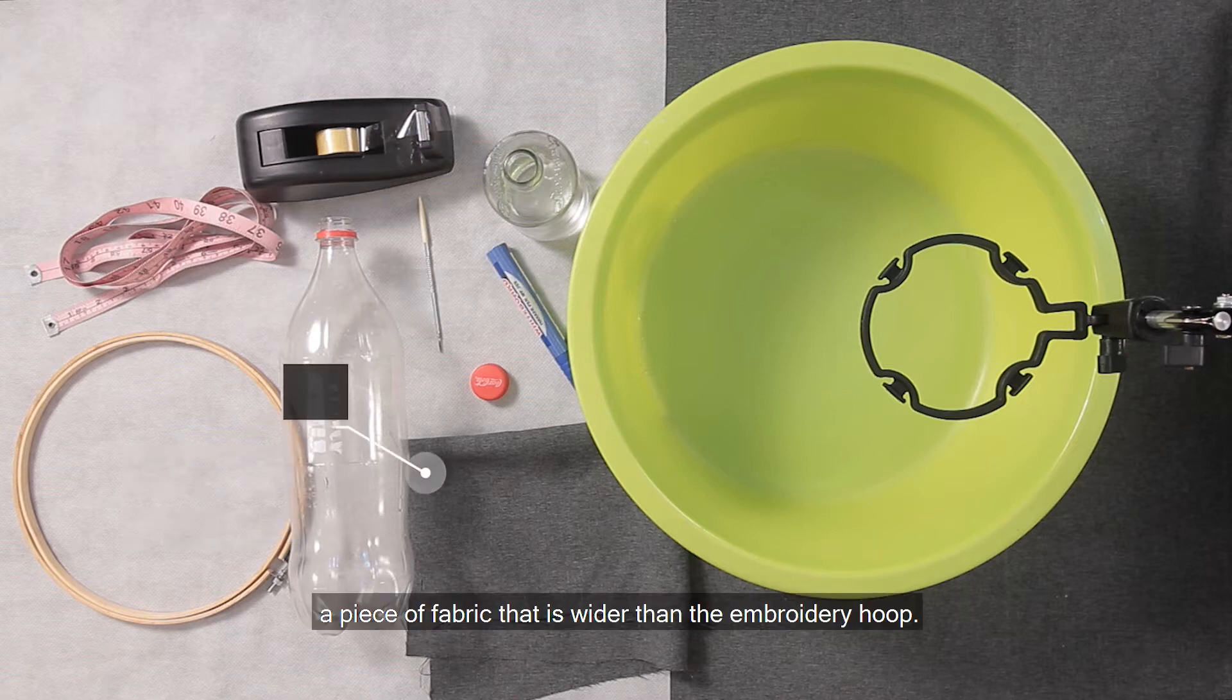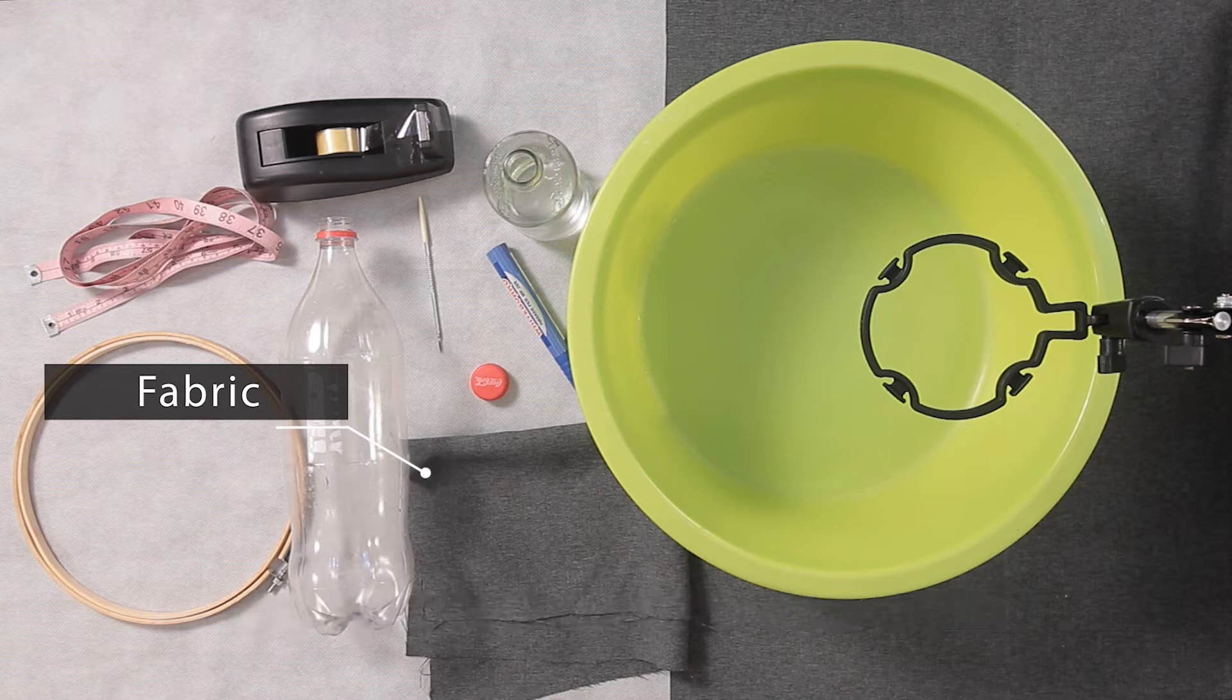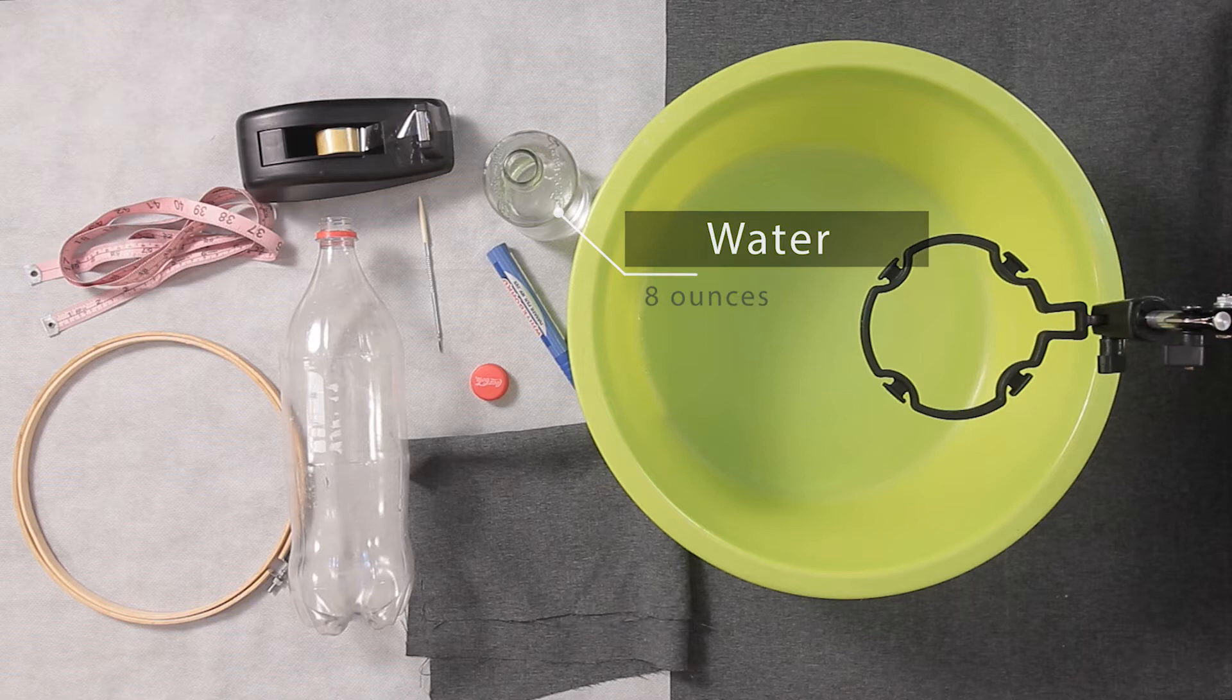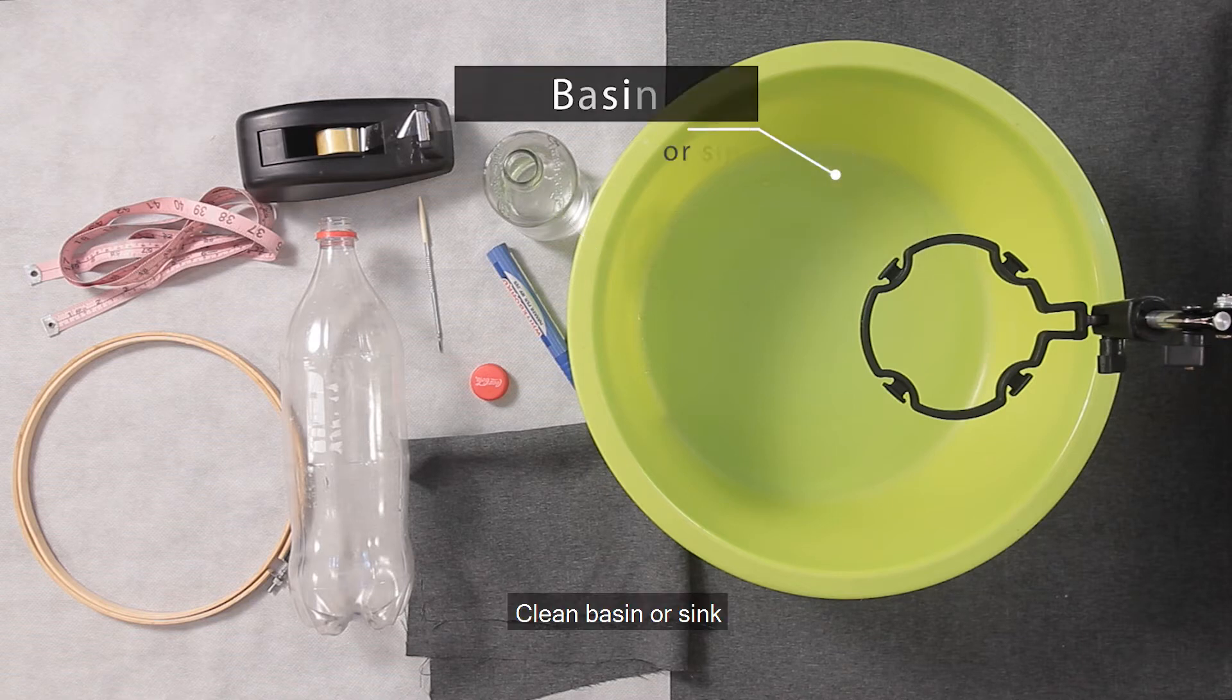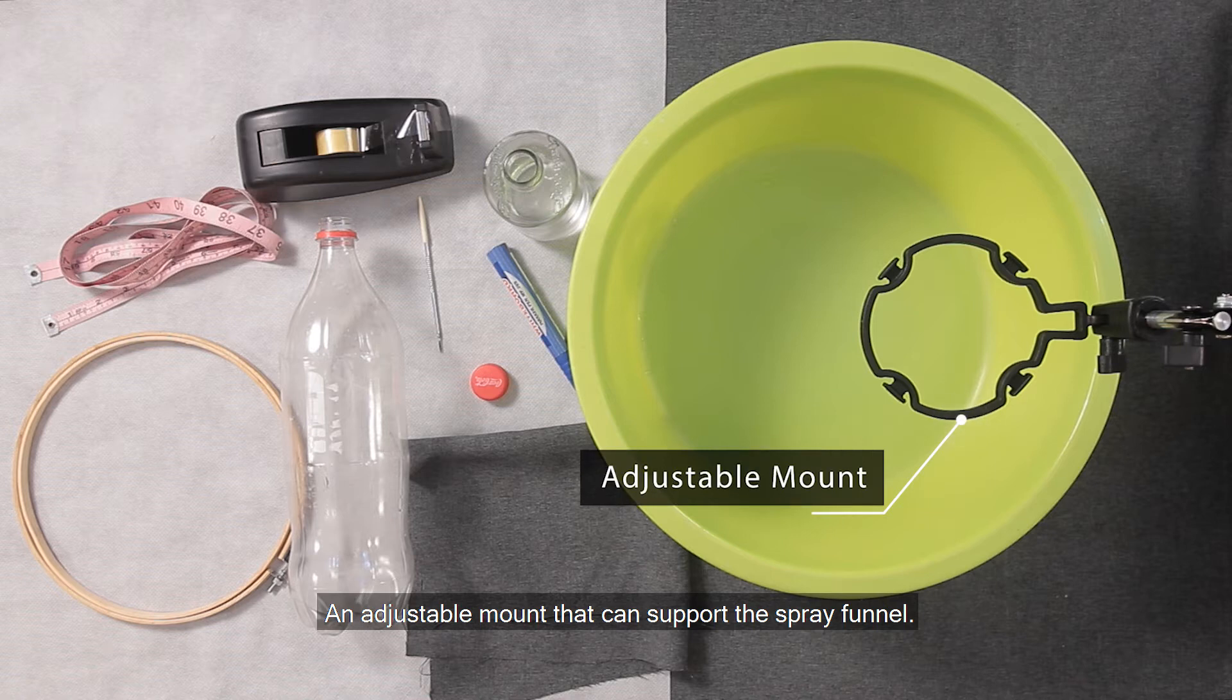Use a piece of fabric that is wider than the embroidery hoop. Uniform medium colors like blue or grey are easier to score than black. You'll also need 8 ounces of water, a clean basin or sink, and an adjustable mount that can support the spray funnel.